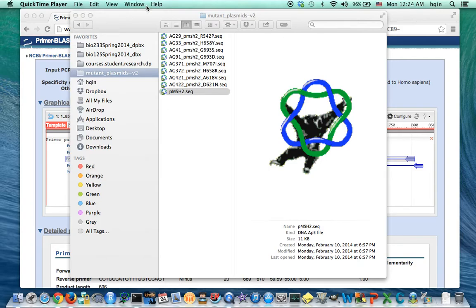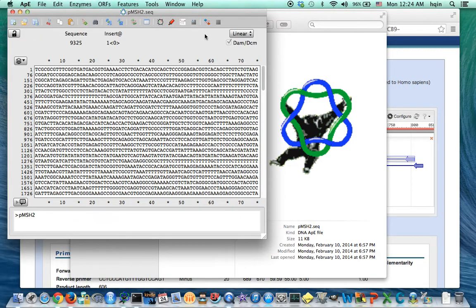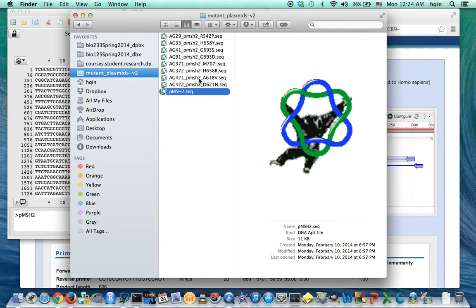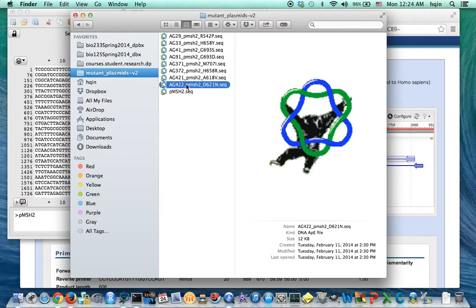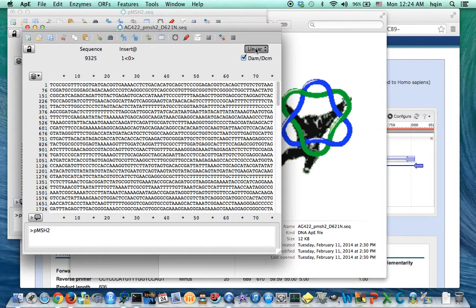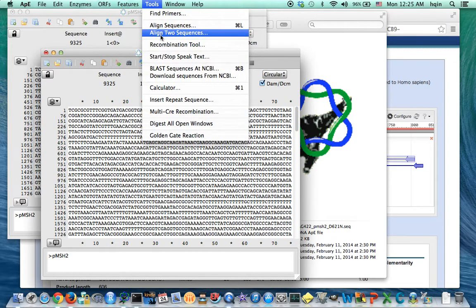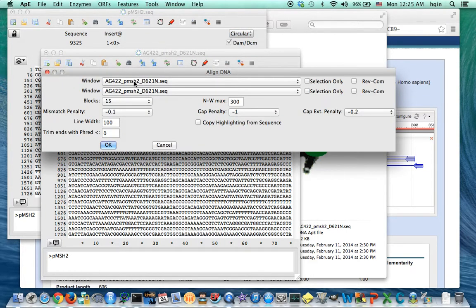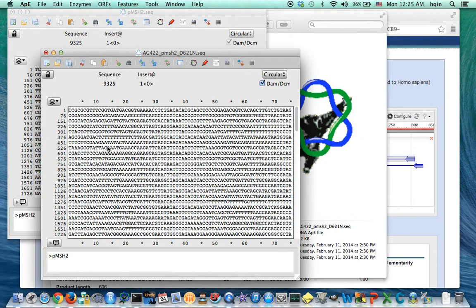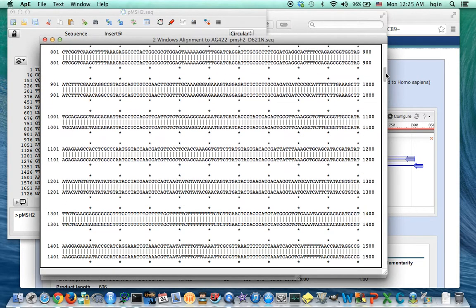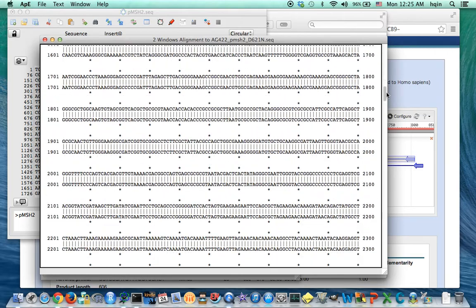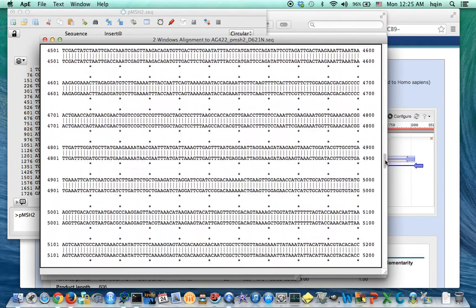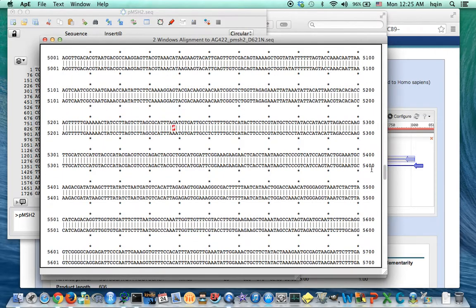So first I'll open the PMSH2 plasmid, make sure this is circular, and I'm going to use AG422 as an example. So first is the align tool, align two sequences. So let's put the wild type on top, mutant on the bottom.